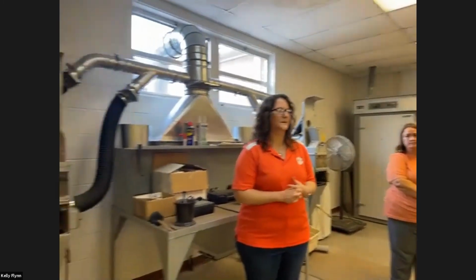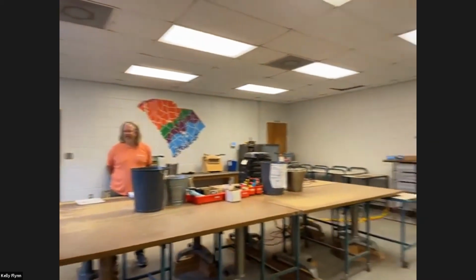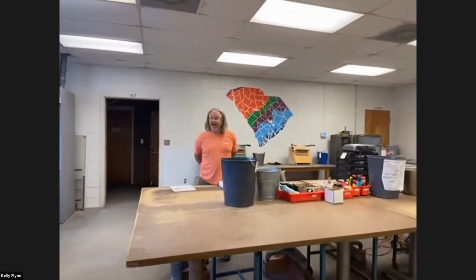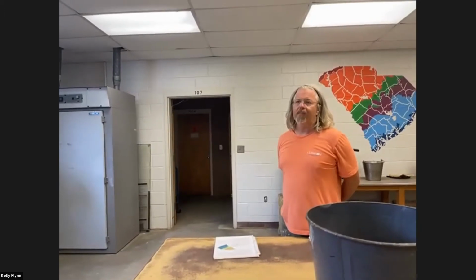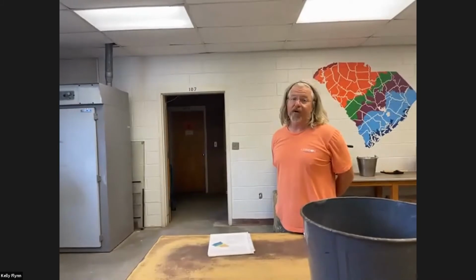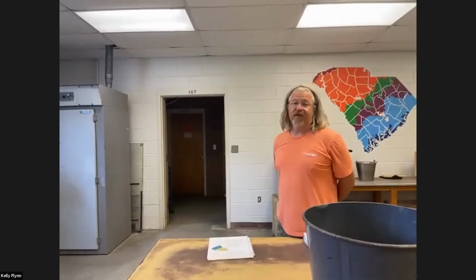In fact, we are currently in the sample receiving and soil prep area of the laboratory, and Michael is going to share with you what we do with soil samples when we receive them here in the lab. So he's going to tell you about how we process things. My name's Michael. I've been here at Clemson 23 years, and we have a loading dock. We receive most of our samples through UPS. During the pandemic, we also started receiving almost all of our samples through the regular mail, the post office, and we still have a lot of clients and customers using that.